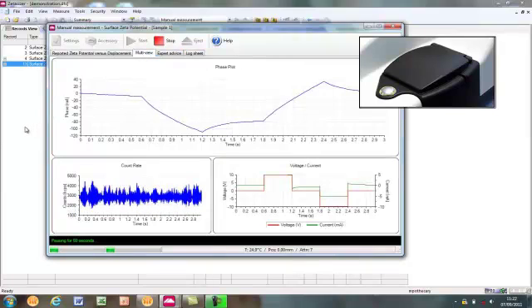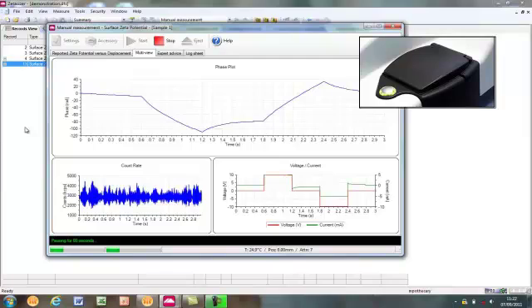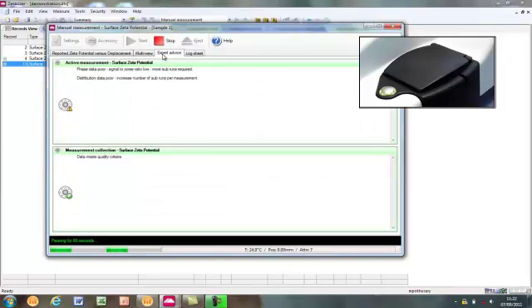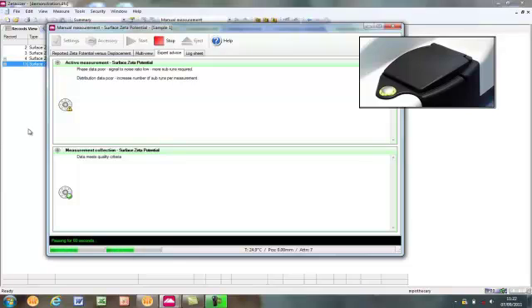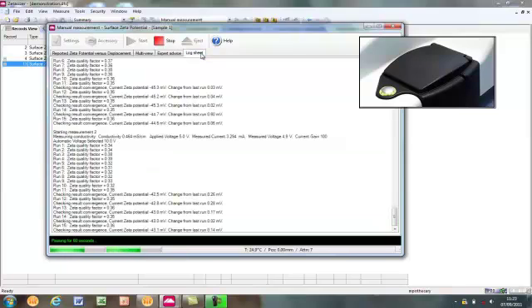The multi-view, as we have seen, shows multiple views of the data collection. In this case, the count rate, phase plot, and voltage and current plot are displayed. These can be changed to any other combination as the user requires. The expert advice tab offers advice of the individual zeta potential measurements, as well as looking at the whole of the surface zeta potential measurement. The log sheet, as with all measurements performed on the zetasizer, keeps a record of everything that has been recorded throughout the measurement.